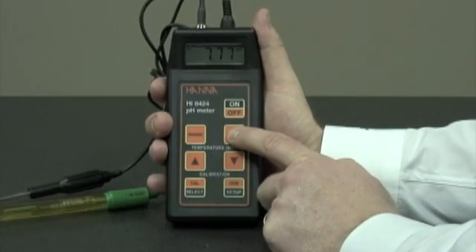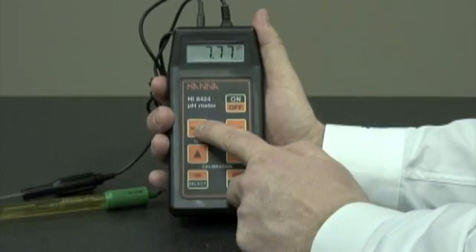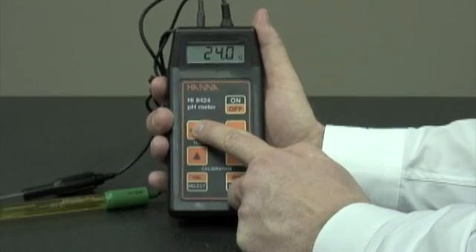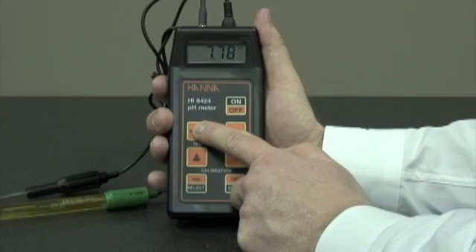We can use the hold button to hold the reading. We can use the range button to show temperature, millivolt, or back to pH.